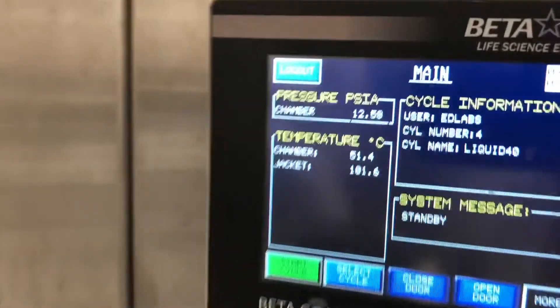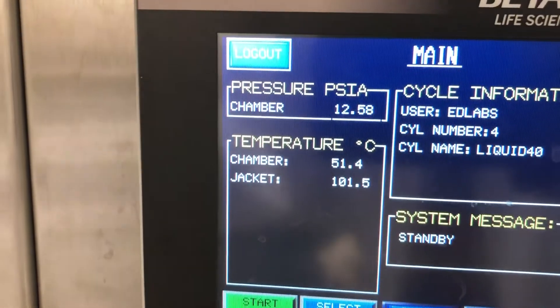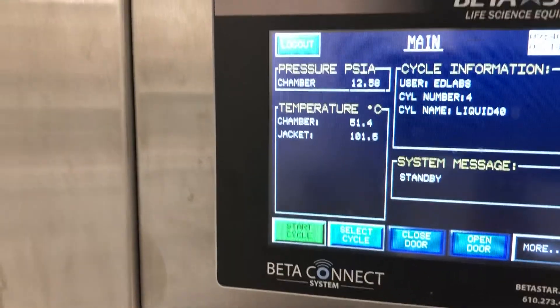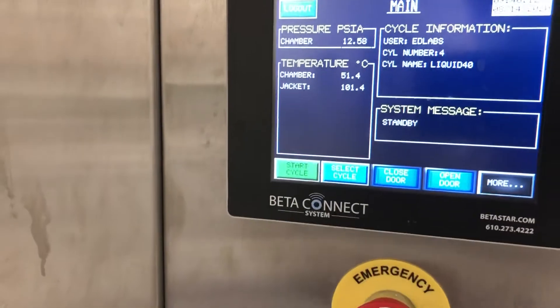You can see here in the chambers: 51 degrees centigrade. The jacket's at 101 degrees centigrade. The chamber's at 12.5 psi, which is atmospheric pressure.